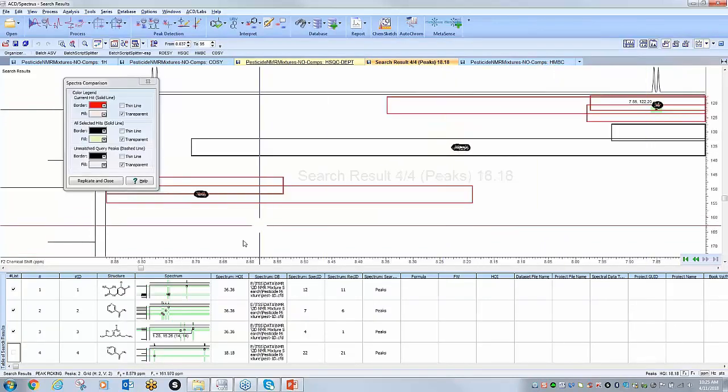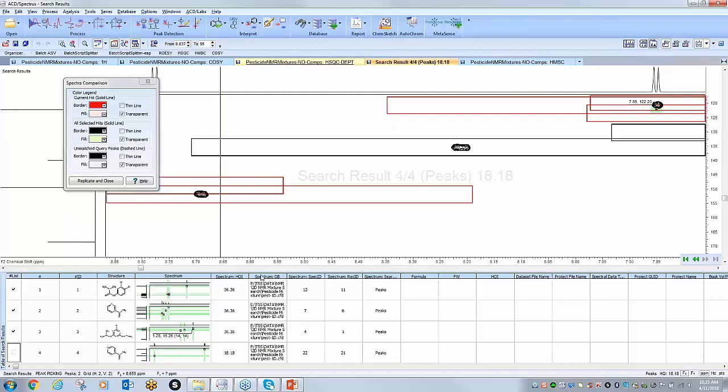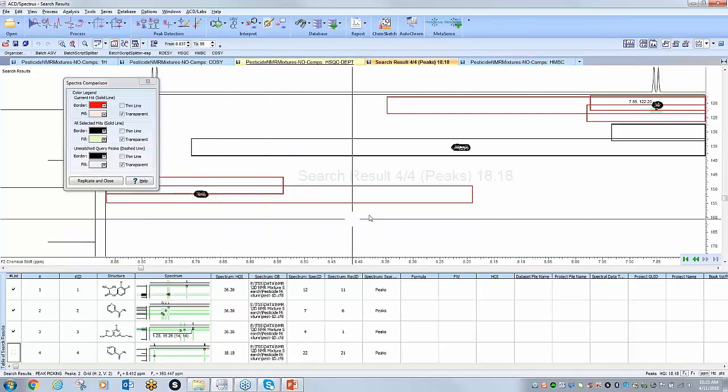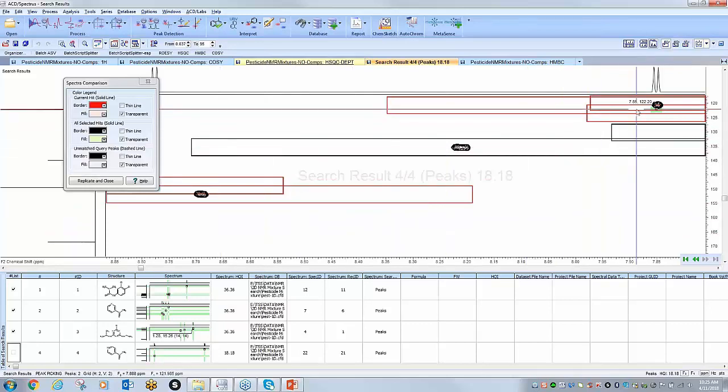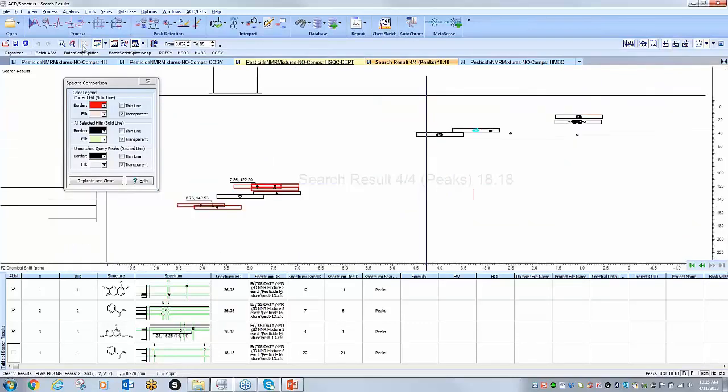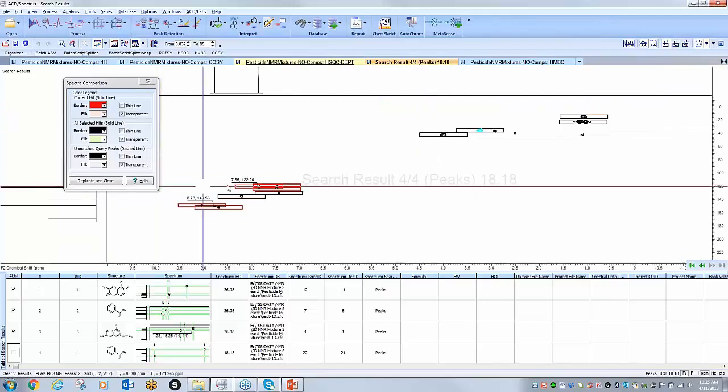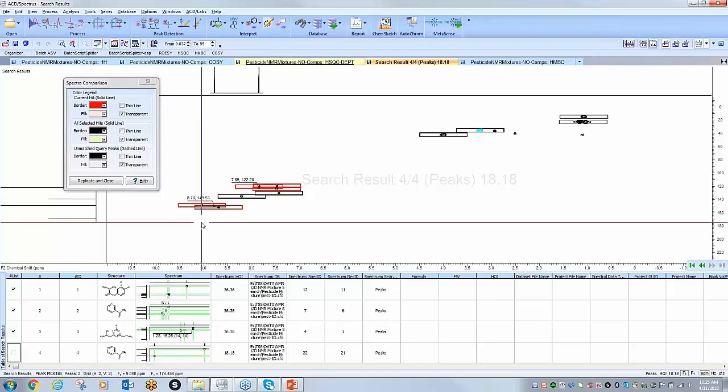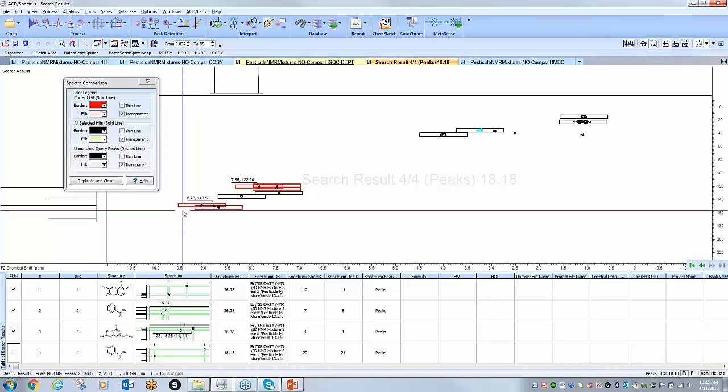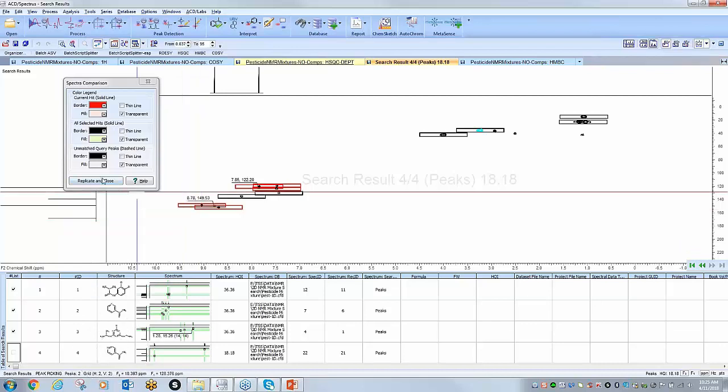It takes me into the region of interest, however I do already have these assigned. And if I zoom out quickly I can see within my structure that this is actually just an isomer of this, so I've already assigned this. So at this point I'm satisfied with everything I've done. I can click replicate and close.